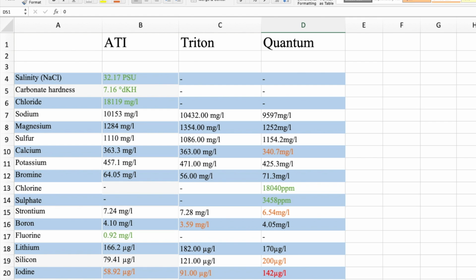If I've got 2 results that are near each other or one that's either higher or lower, I'm going to say that the one on its own is out. I know that's not scientific. I don't have a reference test to compare that against. So be it. So again, for all the haters out there, hate on me, that's fine. Let's move on. For everyone else that's here to see some results, let's get on with it.